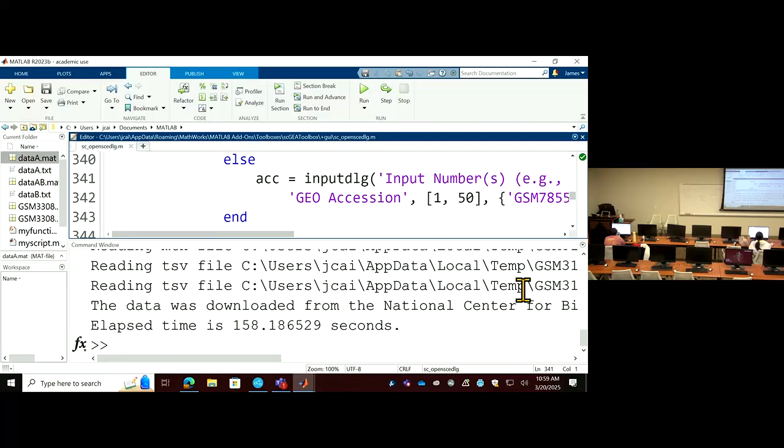Yes, it's weird, I don't know. It's a different file, but we downloaded the same. Let me think. Yeah, you already have that. Different, but I just downloaded the same. Are we using the same version? Yeah, I went to add-ons. Why did we download the same but get different files? Let me see. Do you have a version number?